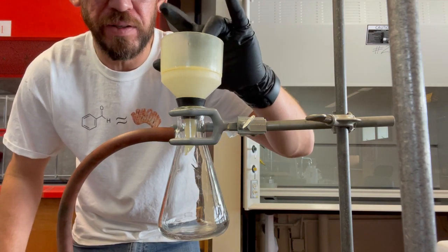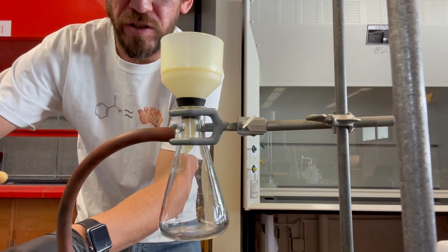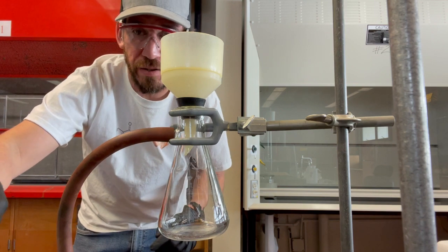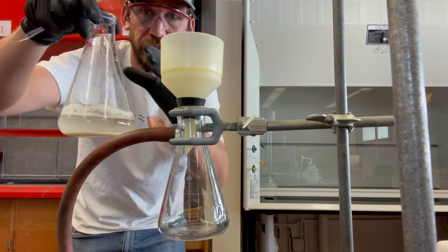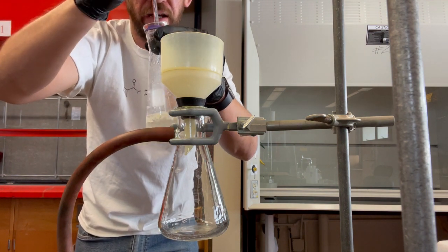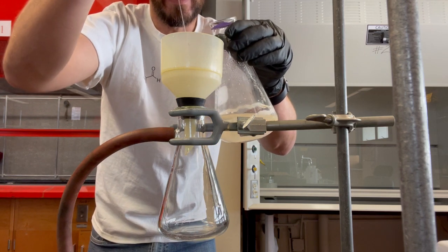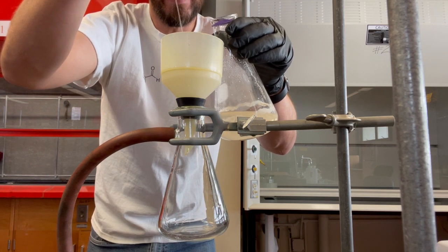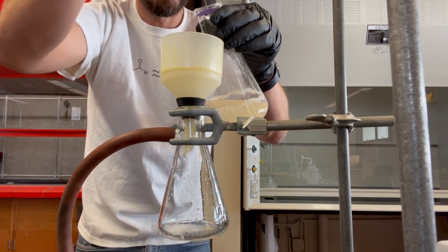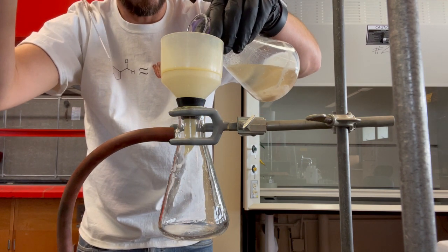Okay, so let's do this, right? We want to filter this bad boy. So I'm going to turn that vacuum on. The first little bit, I carefully took this off so as not to disturb this solution right here. So what I want to do is probably pipette a little off and then see how that goes for a little bit. So let's get a little bit right on that filter paper, that way it doesn't seep underneath. Okay. Oh, that's going to take forever, so I'm going to pour this over like that.